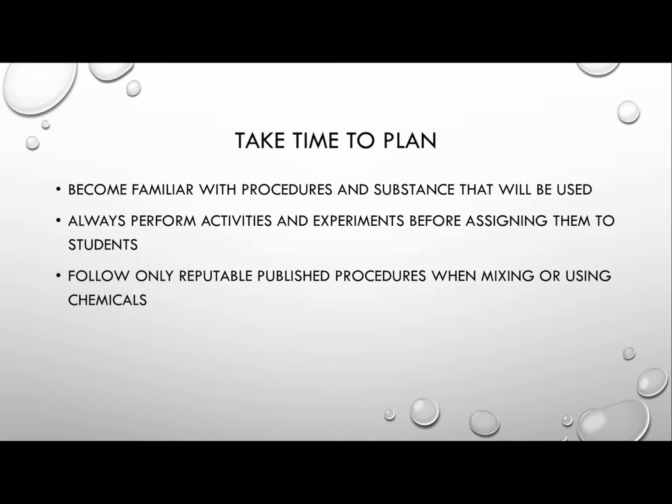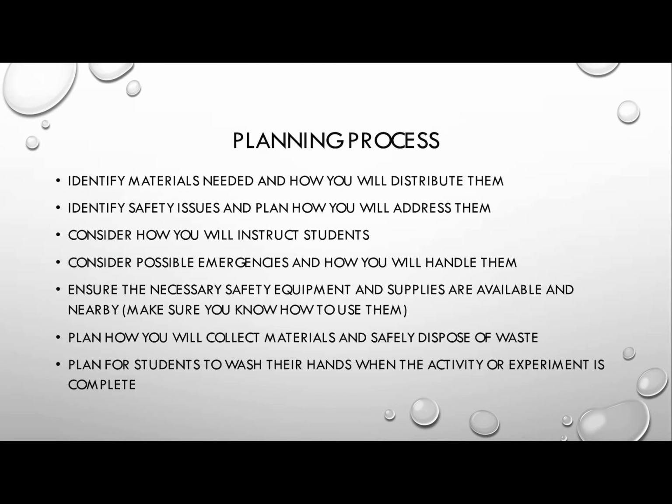And you should only follow reputable published procedures when mixing or using chemicals. But if you're practicing these things before you're starting them, then you really shouldn't have the issue of improper mixing or incompatible chemicals. So what might the planning process include?